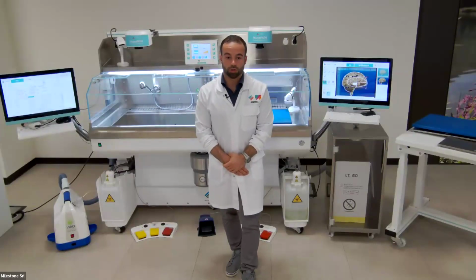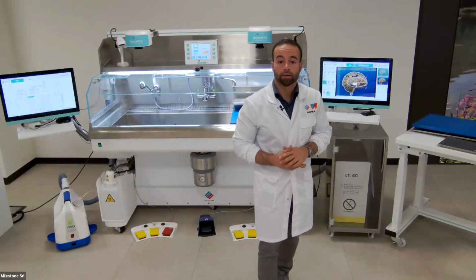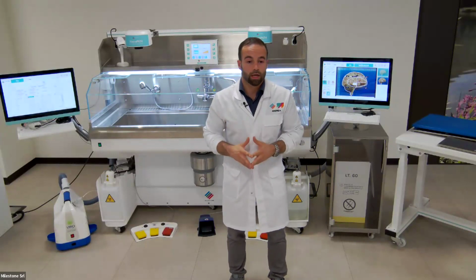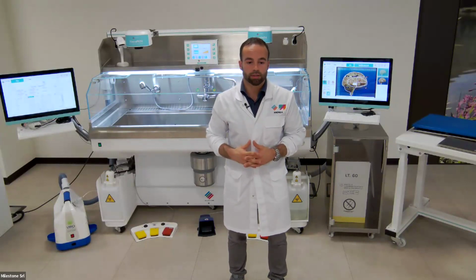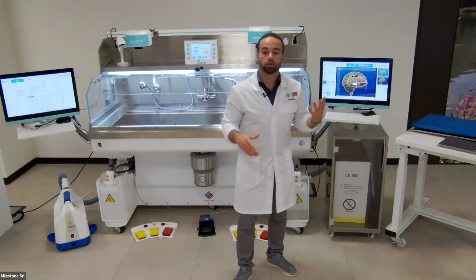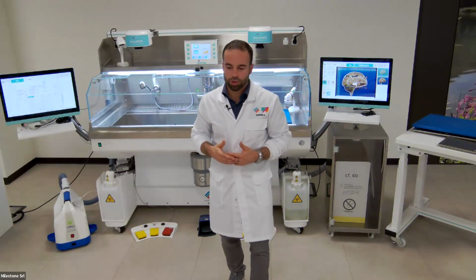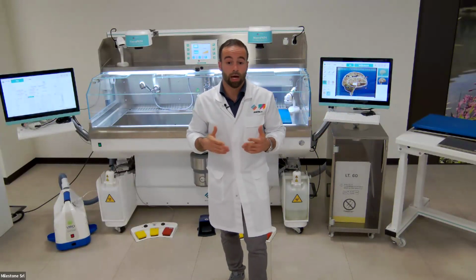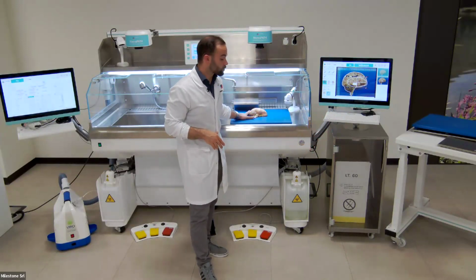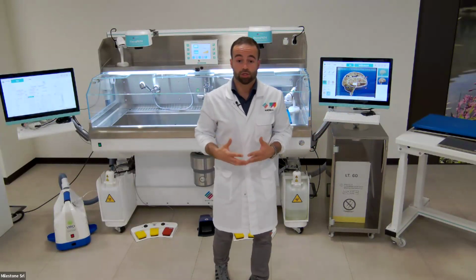Of course, it is possible because those screens, those PCs, are Windows based. So it's possible, like with a common TeamViewer, to see what is happening on this screen, the documentation live, and the grossing activities which are being done under this grossing station. And there are several advantages to using that.